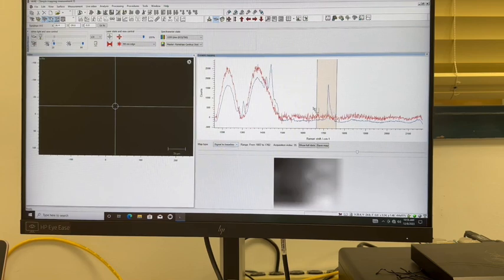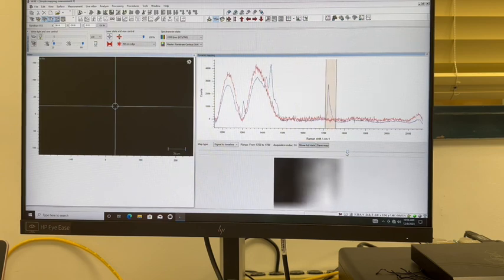You can do a signal to baseline or general intensity. Signal to baseline is typically the most useful. You can then see how that signal and specific peak differs within the entire data set.